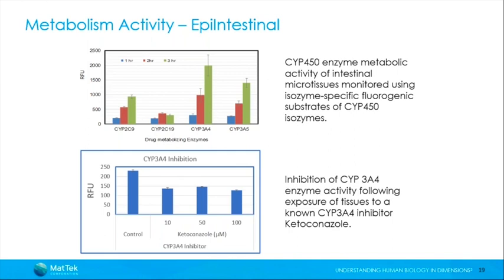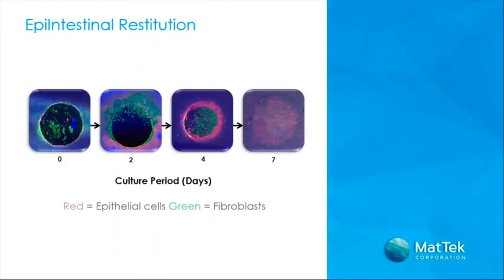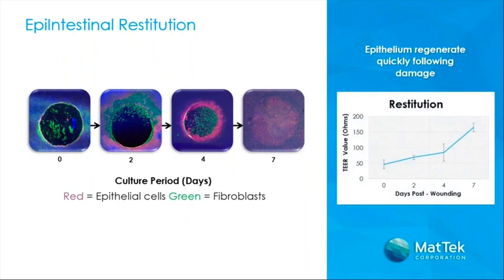So as you can see in the bottom part, the inhibitor was able to reduce the activity. The other application we have is GI toxicity application on this drug model, and we are collaborating with companies on that, and we are going to publish that paper. And we have seen that drugs that have failed in humans have been predicted correctly in our tissue model.